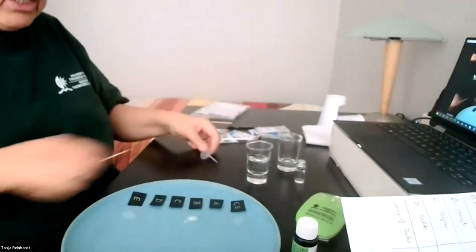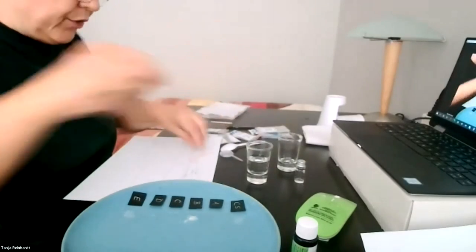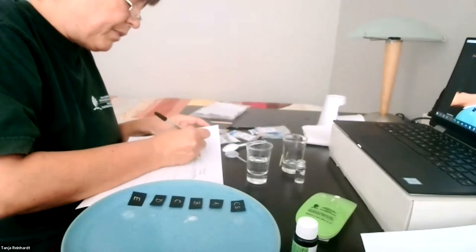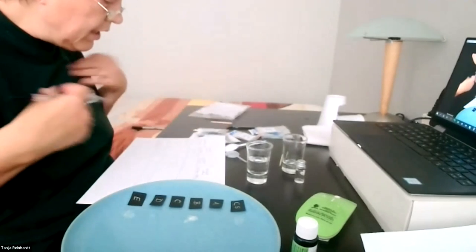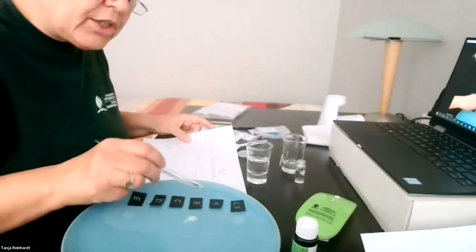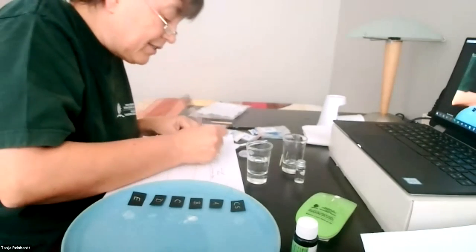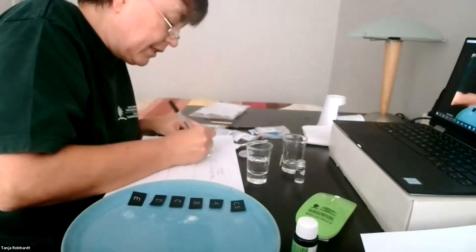Okay. So now we're going to fill this into our table. All right. So what we can do is, for example, in our observation, dissolves bicarb. So we can make it a cross and a tick because we are not quite sure. But I would say it's more like a tick, maybe not. With a starch, with the crime scene powder, and I'll just note it here, it's a cross and a tick.